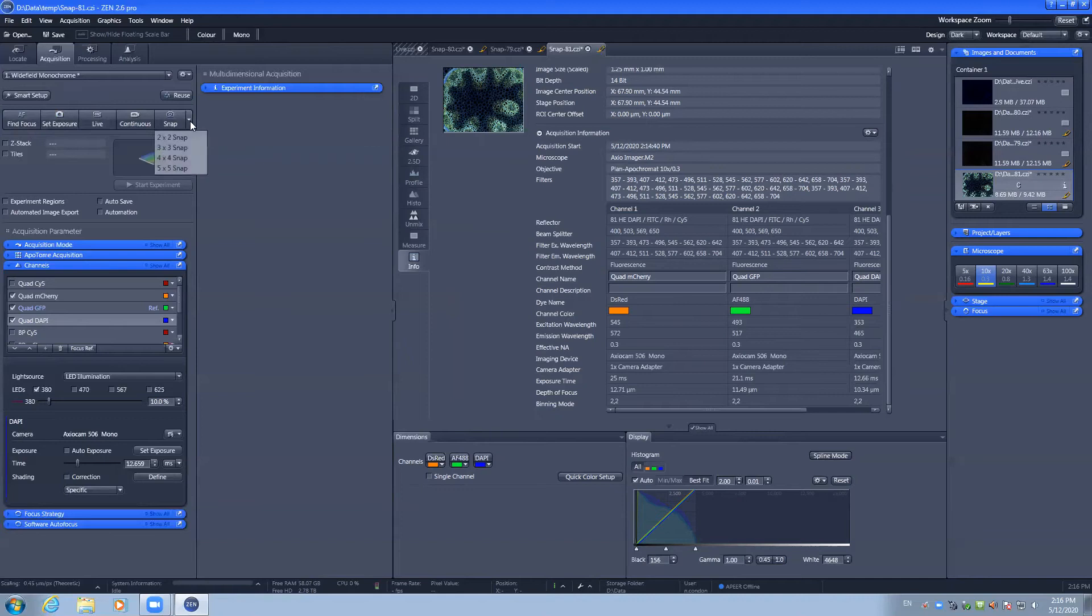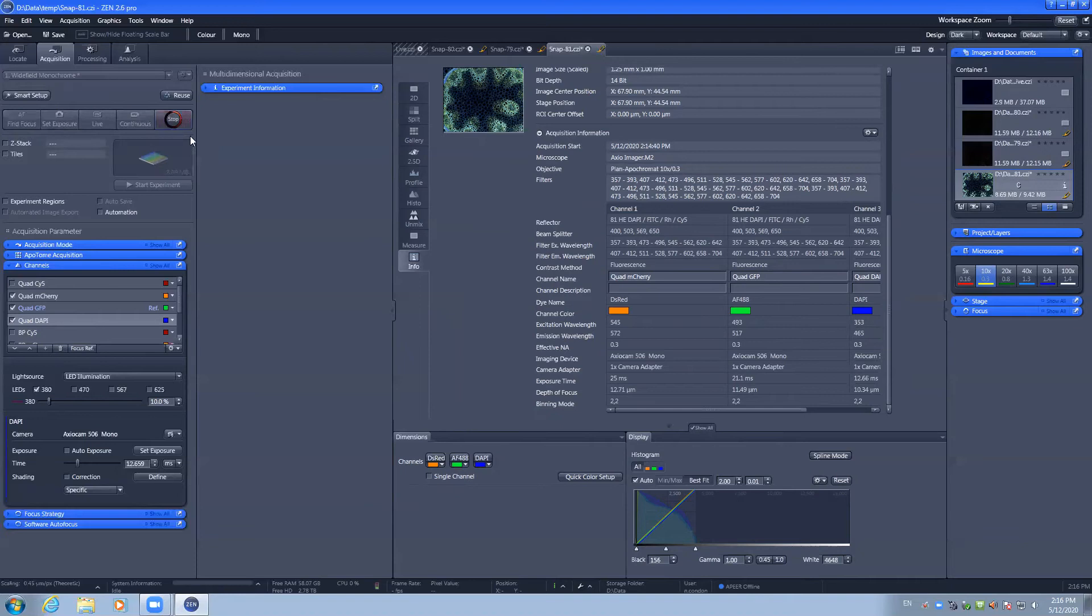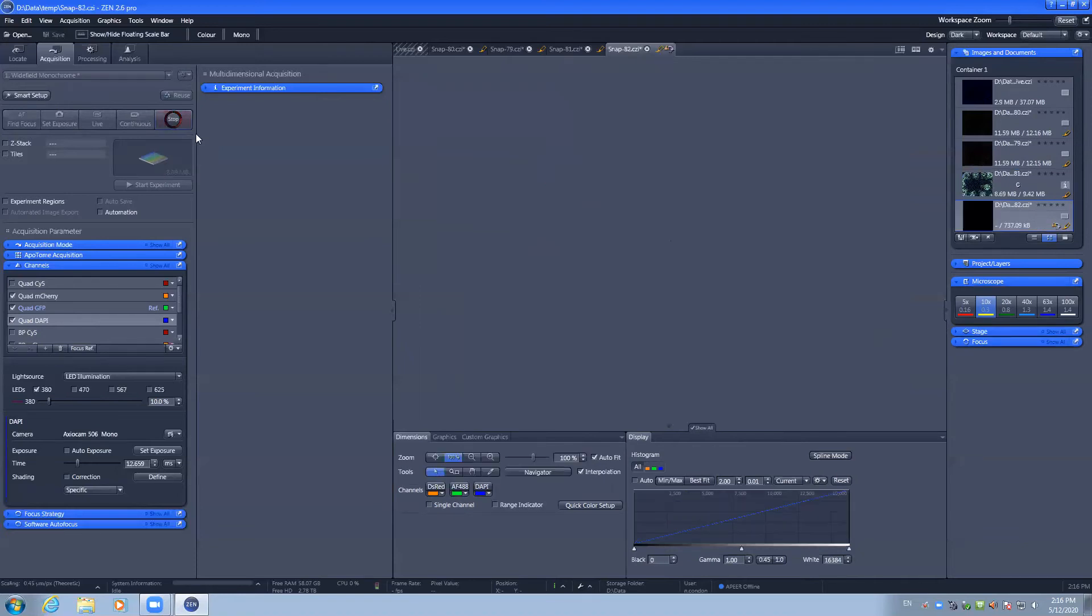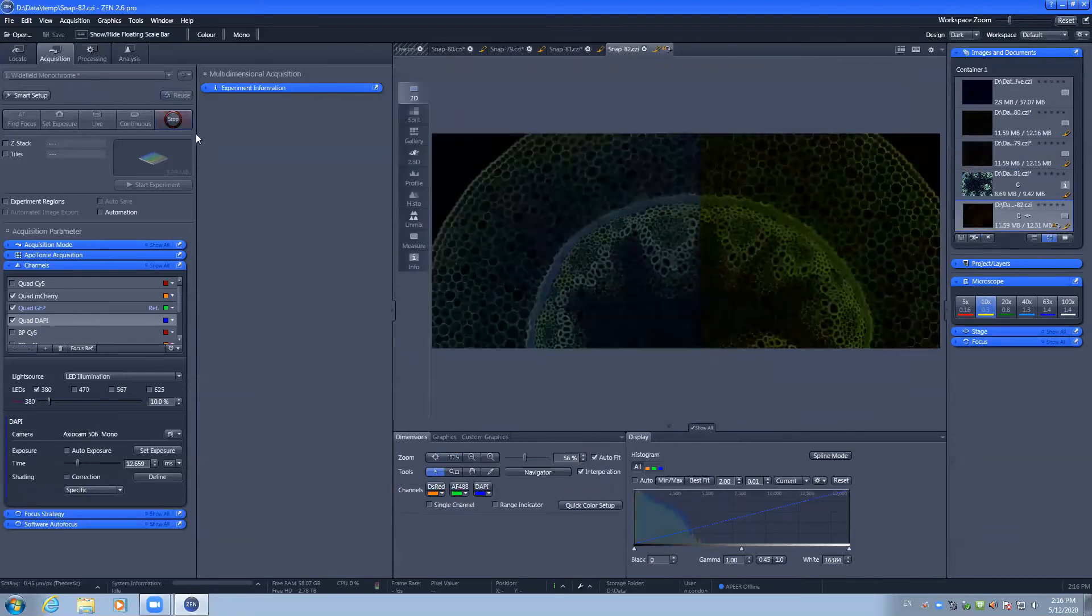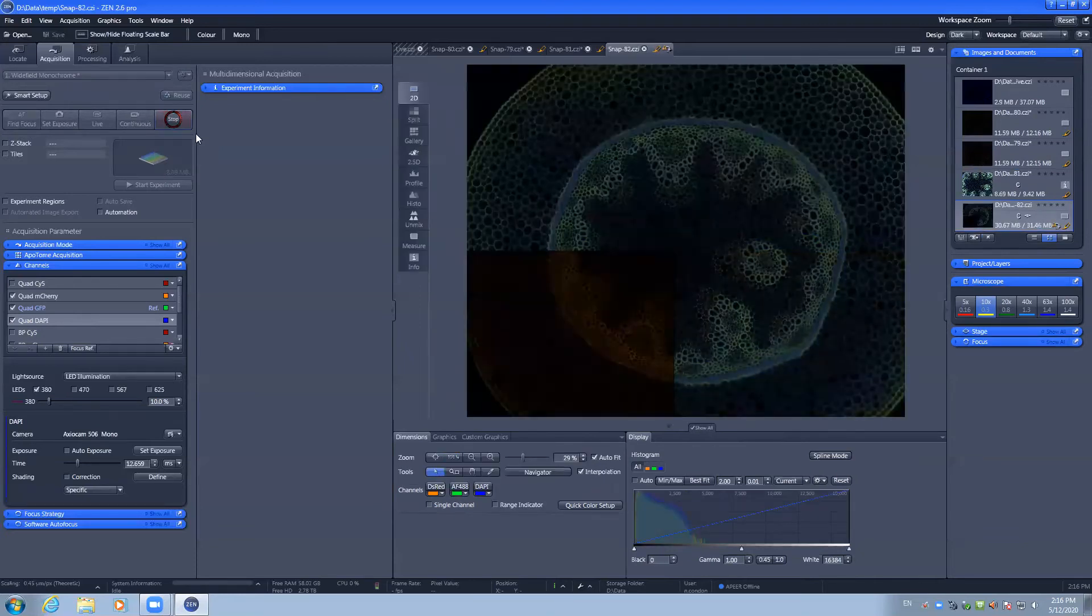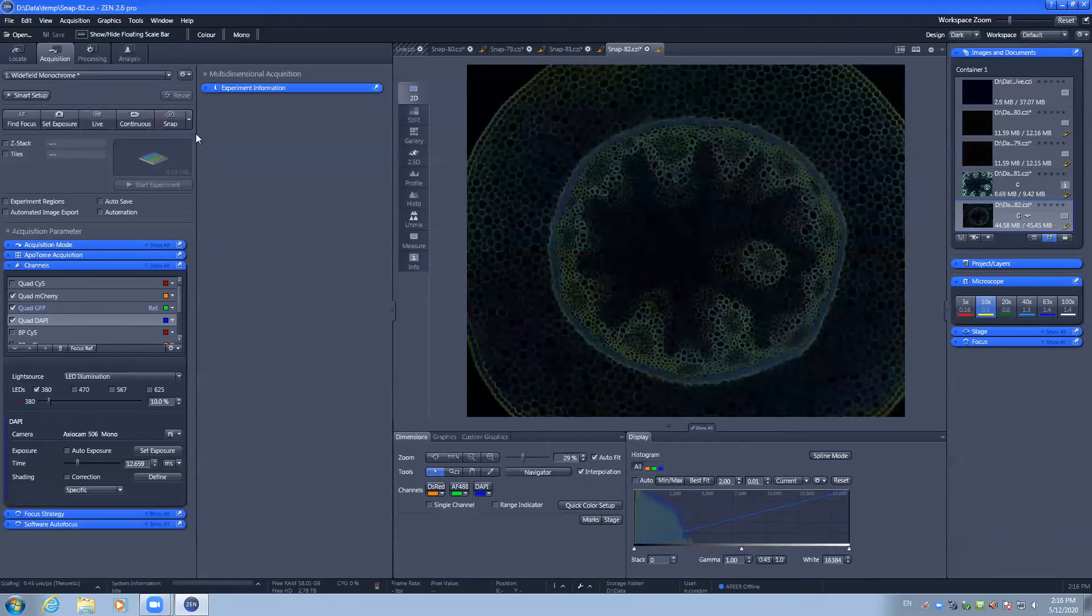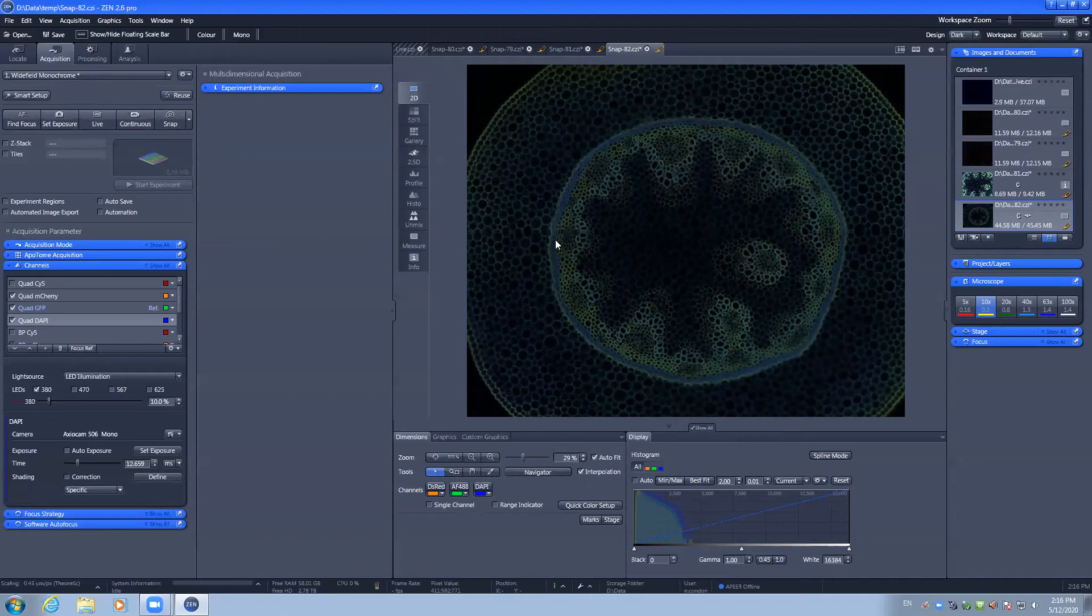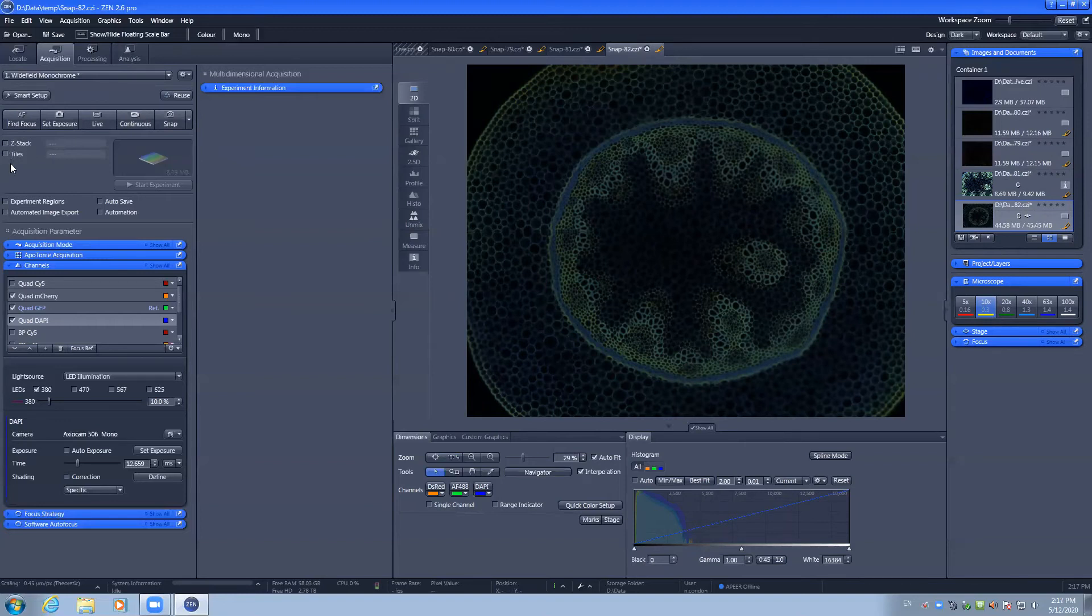Next to snap is a 2x2, 3x3 etc. where you can take a quick tile of multiple image positions to get a better overview of your sample. This isn't stitched by default and if you intend to capture tile images, the multi-dimensional tile mode should be used.